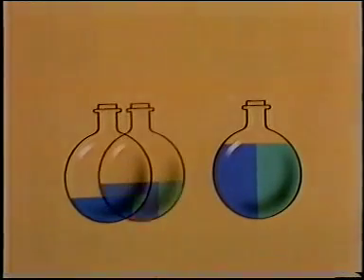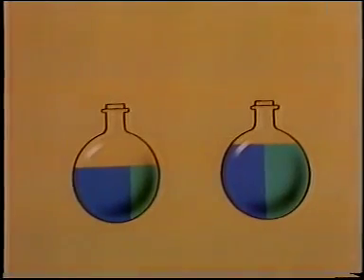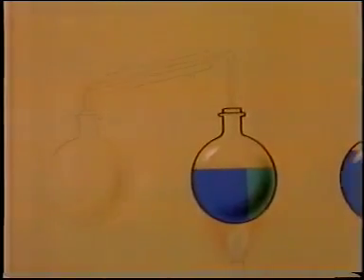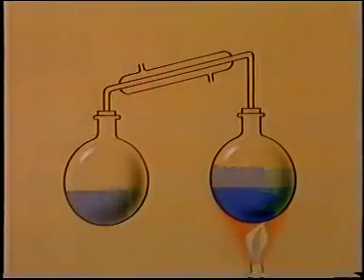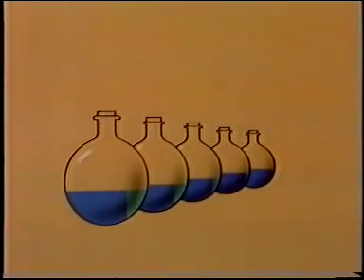The combined residues, about 3/4 of the original mixture, though richer in the high boiling liquid, are still very impure. If these combined residues are now redistilled, more of the lower boiling liquid can be obtained. At each successive distillation, the residues become richer and richer in the higher boiling liquid.